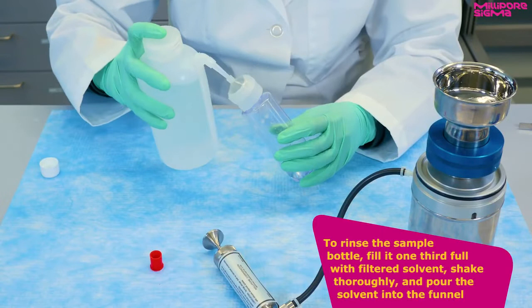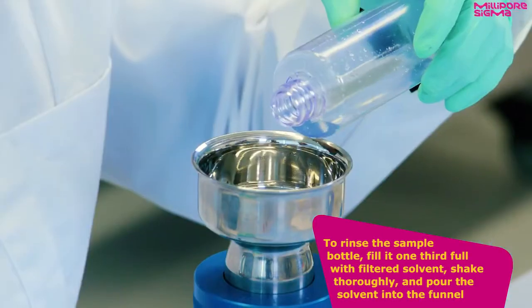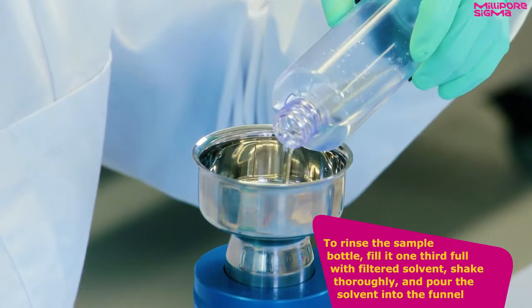To rinse the sample bottle, fill it one-third full with filtered solvent, shake thoroughly, and pour the solvent into the funnel.